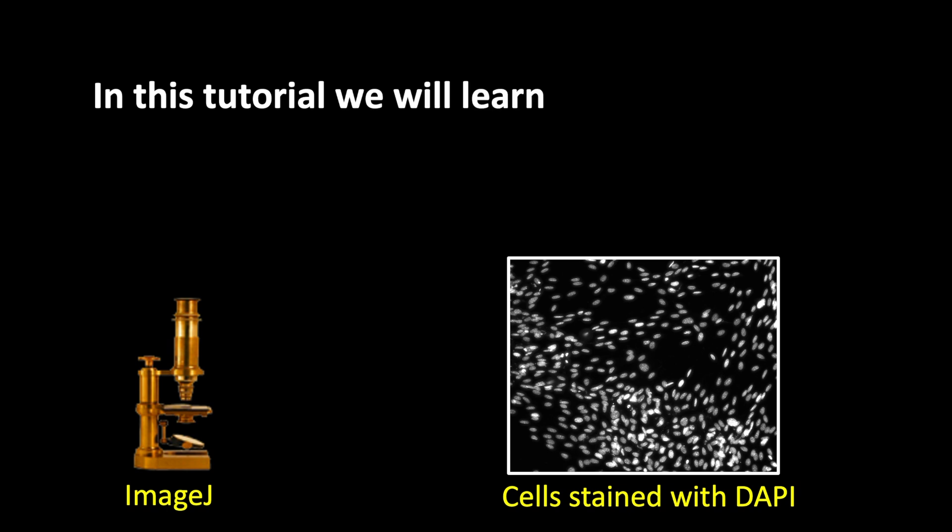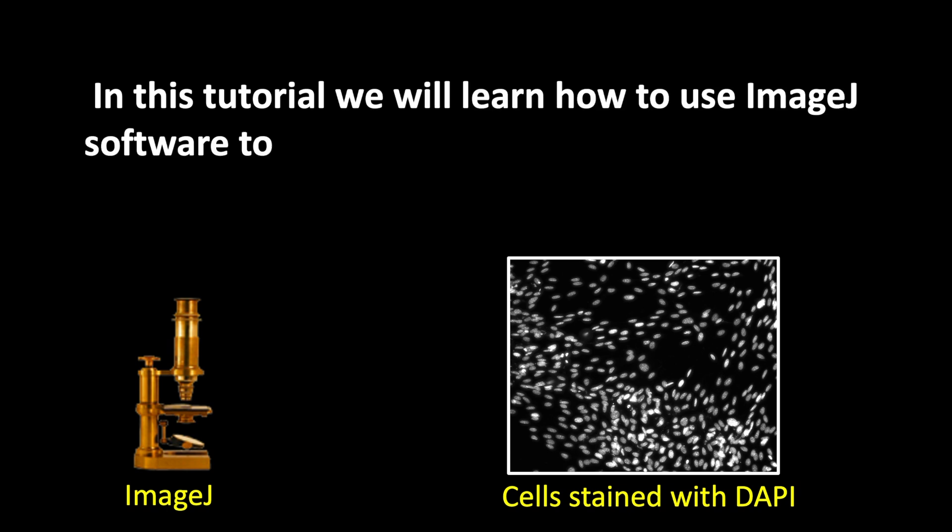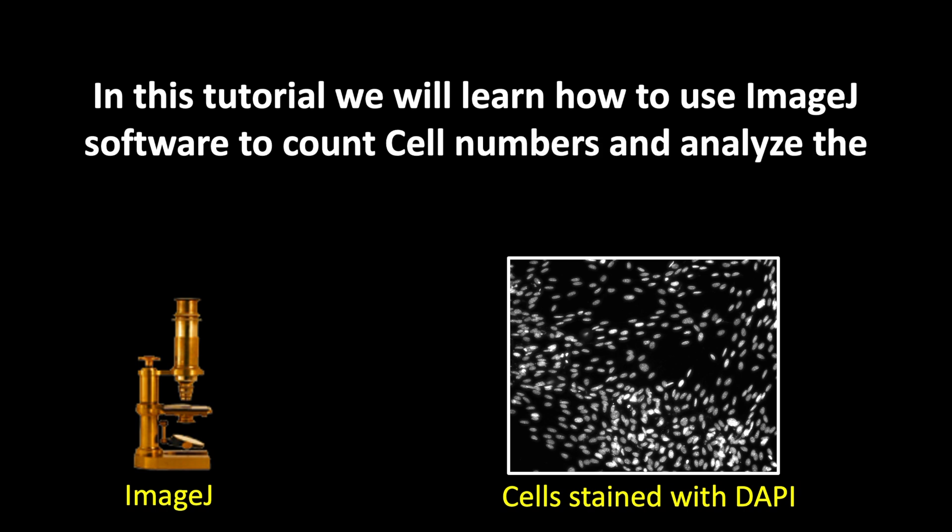In this tutorial, we will learn how to use ImageJ software to count cell numbers and analyze the area and the intensity.